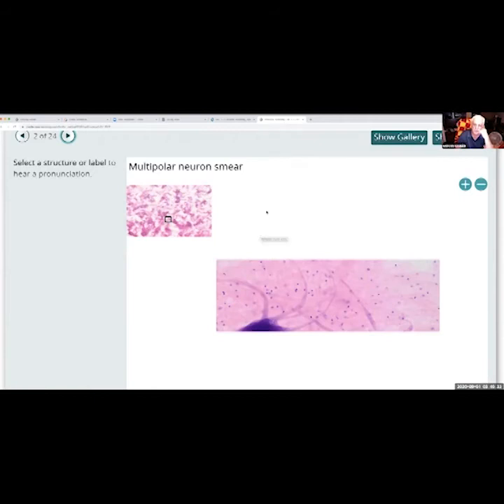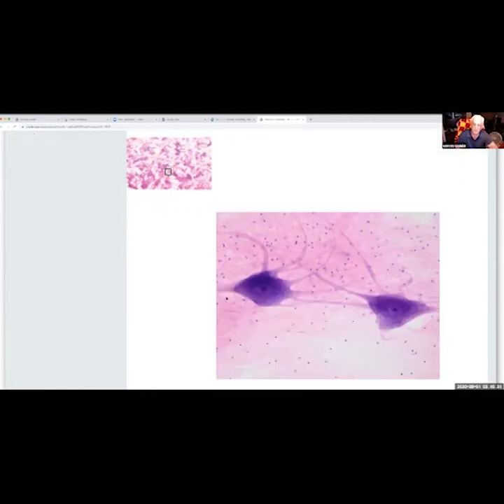Okay, here's a bit bigger one, which is good. Okay, again, these are your dendrites that line up. See all these little ones here. But all this information, these are all feeders. Information comes into all these dendrites. And this big thick one here comes off. This is your axon coming off the cell body.